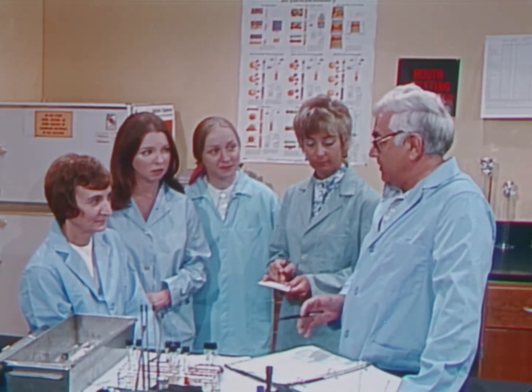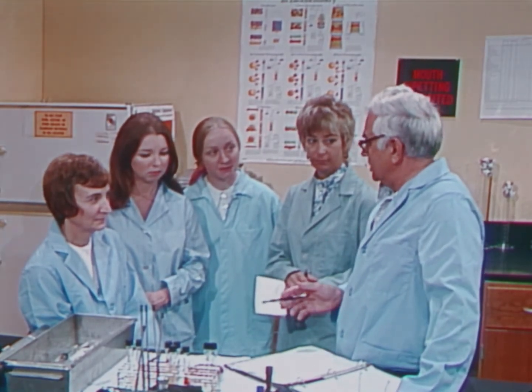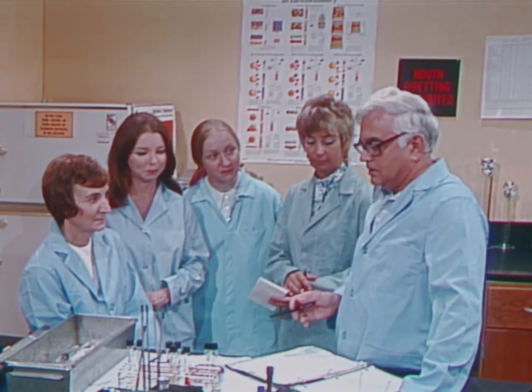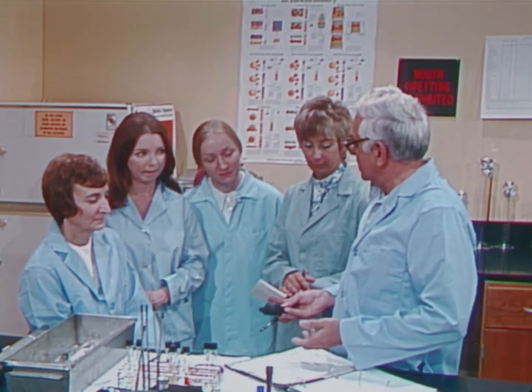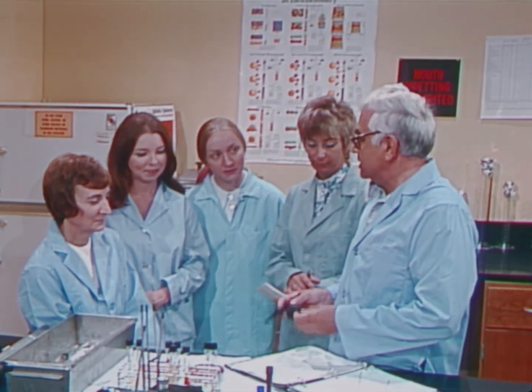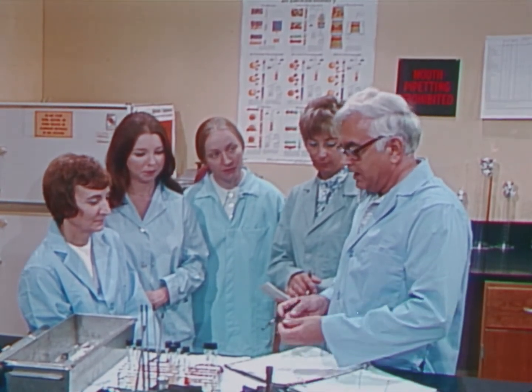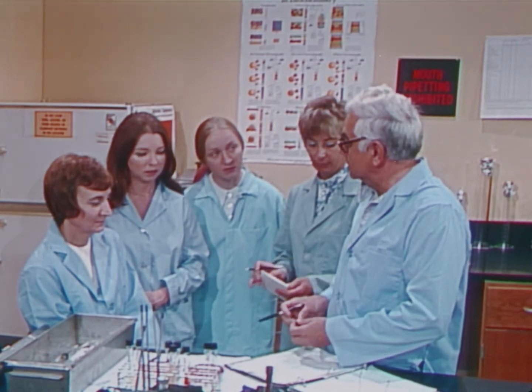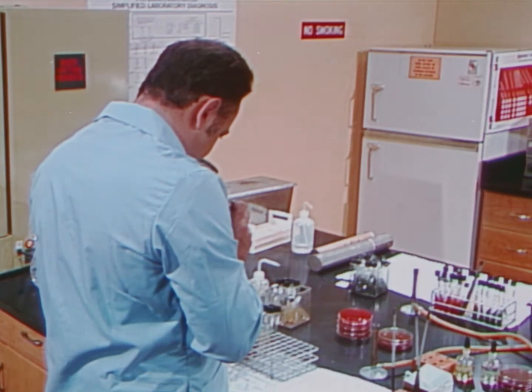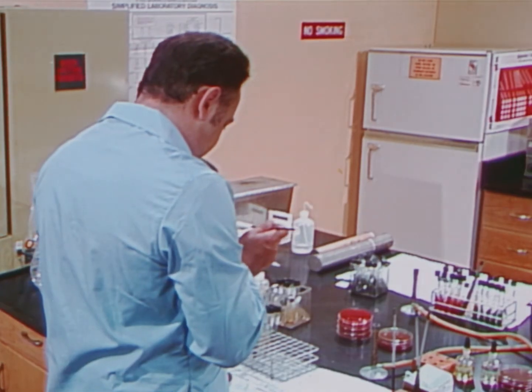We have now identified 4 infection-determining factors: extent of contamination, route of infection, virulence of the organism, and host susceptibility. The importance of these factors varies from one pathogen to another. We shall now look more closely at the role of aerosols as a cause of laboratory infections. Potentially infectious aerosols are formed when common laboratory tools are used.